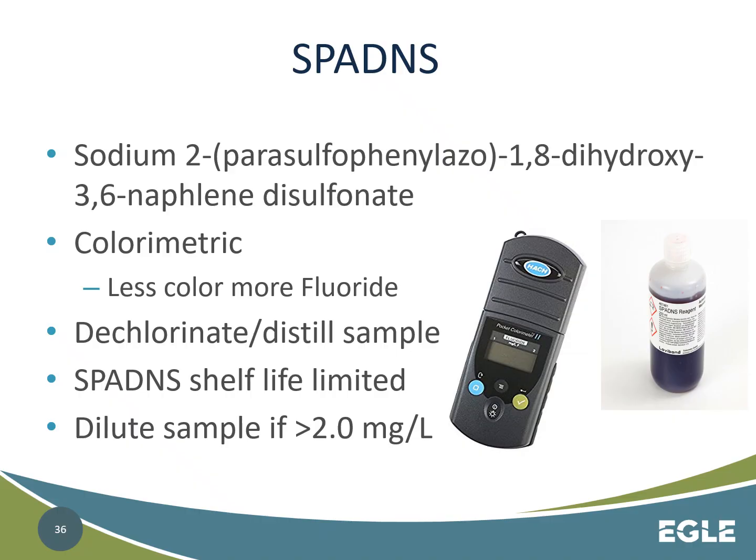SPADNS is an acronym because it stands for sodium 2-(parasulfophenylazo)-1,8-dihydroxy-3,6-naphthalene disulfonate. That's why we call it SPADNS. It's a colorimetric method very similar to the DPD colorimetric method used for chlorination, where we add this reagent and it forms a zirconium complex with the available fluoride.